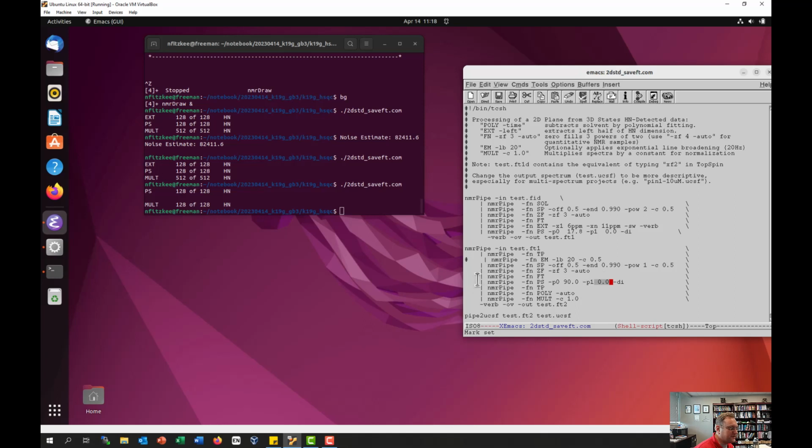And the reason I say that is because this is defined really by the pulse program itself, right? The direct detect dimension, the proton dimension, you always have a little bit of uncertainty in where you start acquiring the data. But the nitrogen dimension, if the pulse program is written properly, it should be very clear that you need 0 phasing or 90 degree phasing, and particularly the first order phasing should almost always be 0 or minus 180. And so a lot of times you'll see, or maybe sometimes plus 180, I forget, the sign is different in TopSpin versus NMRDraw.